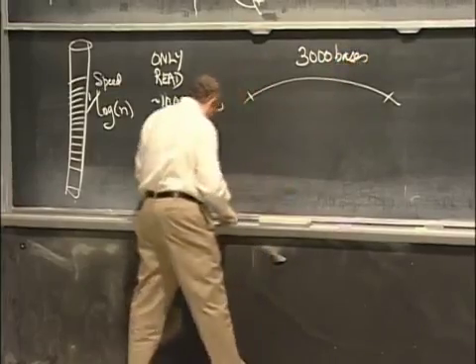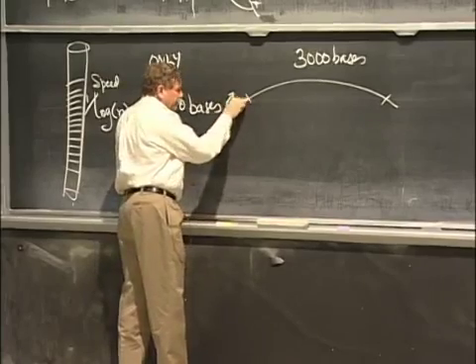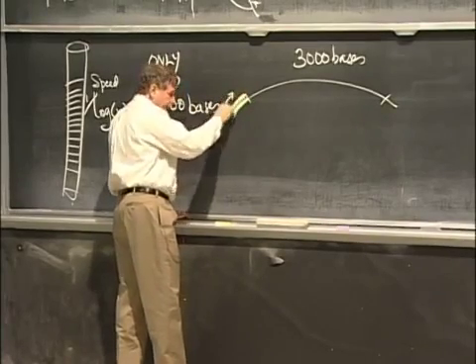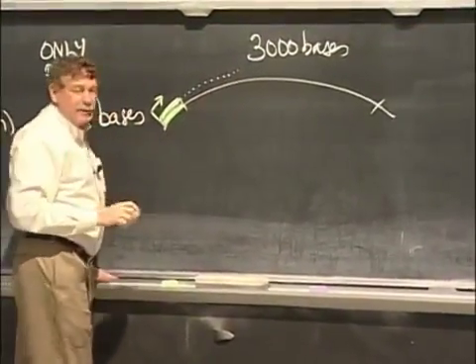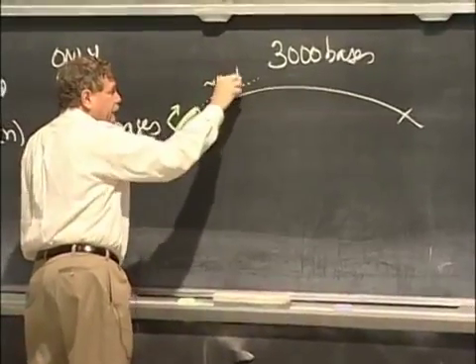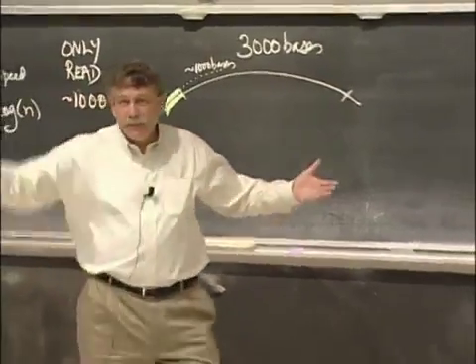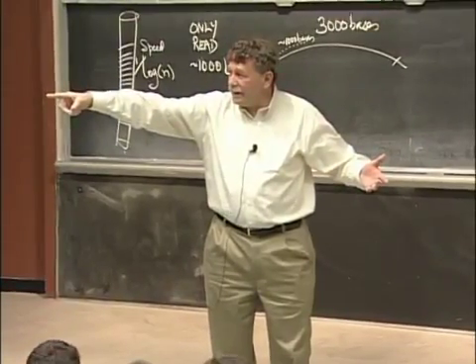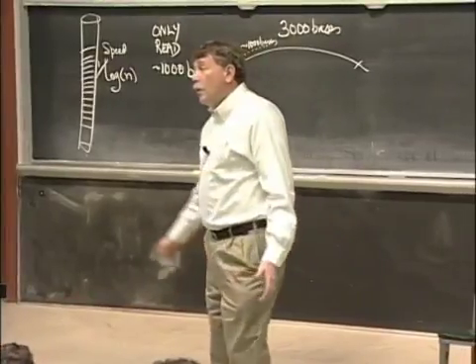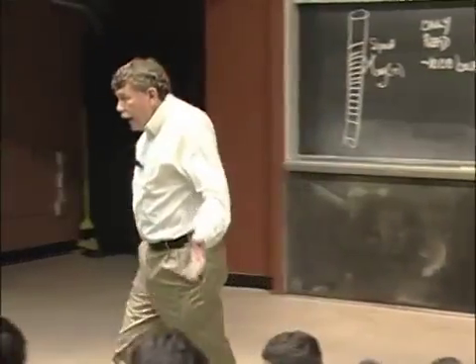Well, we've got our clever trick of cutting back over here at some previous site, using our primer here, and reading. But it kind of dies at about 1,000 bases. I can't read any further. What do I do? Once you have identified the first 1,000, we can get another restriction enzyme, so that once we replicate it, we apply it so that it cuts it. What if there's not a perfect restriction site there?